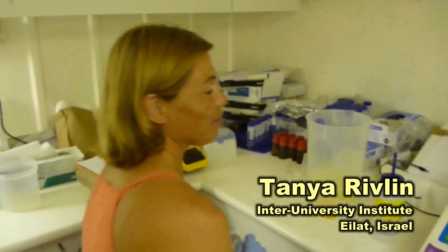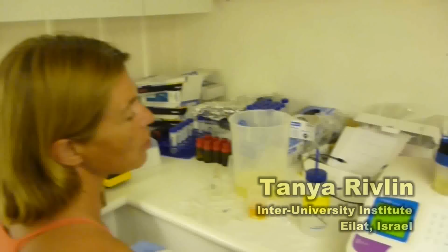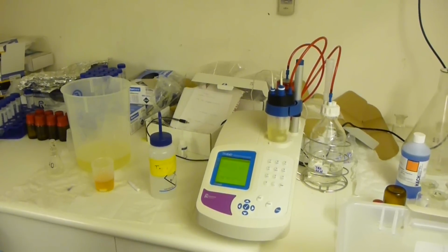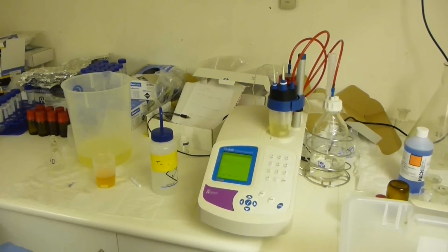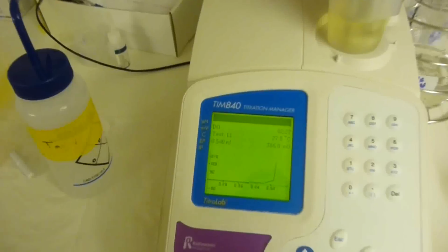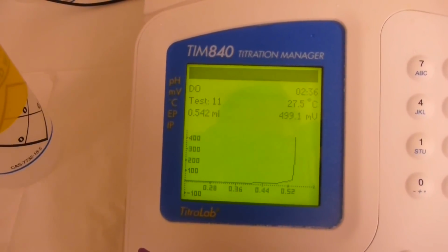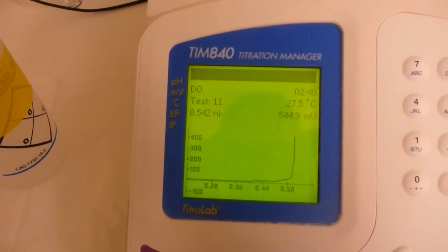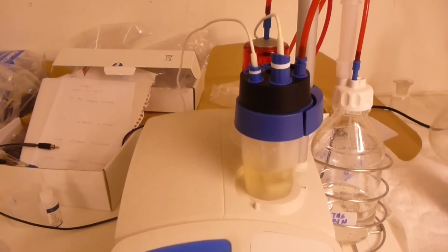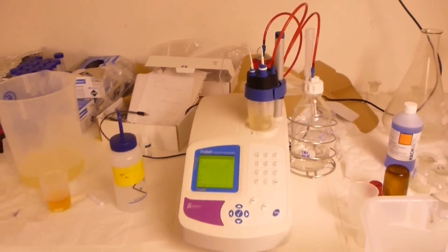So Tanya, what are you measuring? I'm measuring dissolved oxygen in water samples by automatic titration, the Winkler method, a very old wet chemistry method. It's done in order to calibrate the logger that is in the reef, the CTD, which measures every 2 minutes, so practically all the time. The measurement is done by an electrode in the field, and the electrode needs to be calibrated. So we take not a huge amount of samples like alkalinity, only 20 samples, and we measure them by titration, the old-fashioned but straightforward method that measures dissolved oxygen, and then we calibrate the CTD measurements.